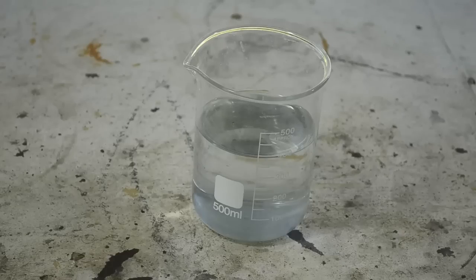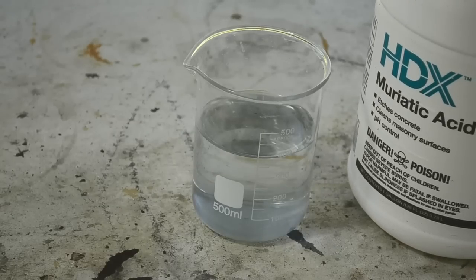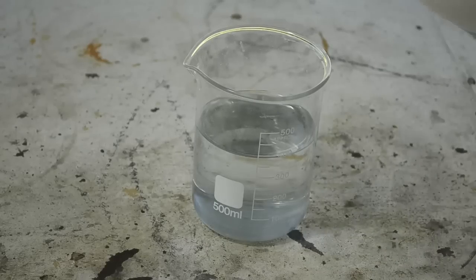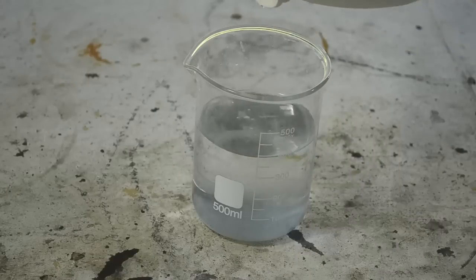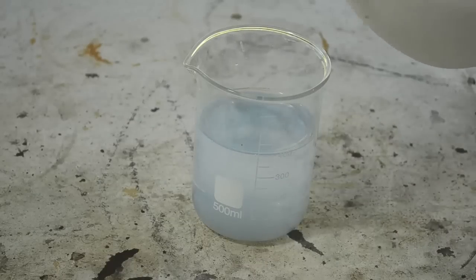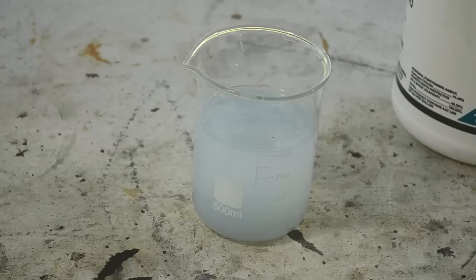So I want to try and convert it to something even less soluble in water and see if it comes out of solution. So I'm going to put some muriatic acid in here and see if we can convert any of that to silver chloride and see what happens. Well, yeah, see it go milky white? So there is some silver dissolved in there, which I was afraid would happen with the sulfuric acid.